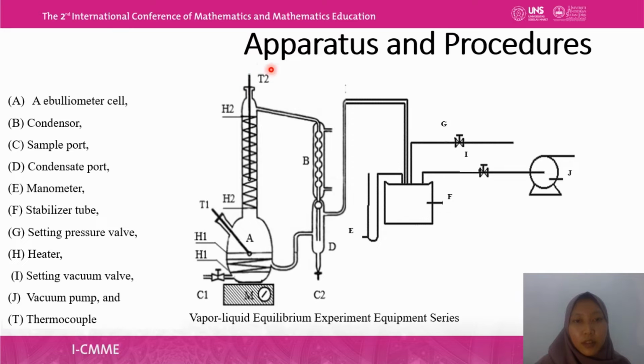Read the temperature indicators T2 and T1, and then take the sample of liquid in C1 and take the sample of vapor phase in C2.